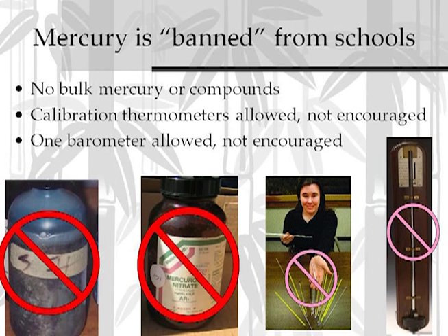There are digital thermometers now that are more accurate than the mercury thermometers. For routine use, the alcohol thermometers work perfectly fine. And if you do have a spill, you're not looking at thousands of dollars to try to clean it up like you would be with an elemental mercury spill from a mercury thermometer.